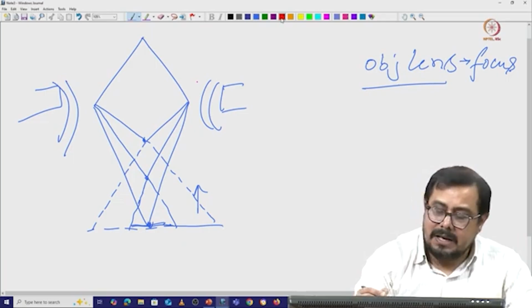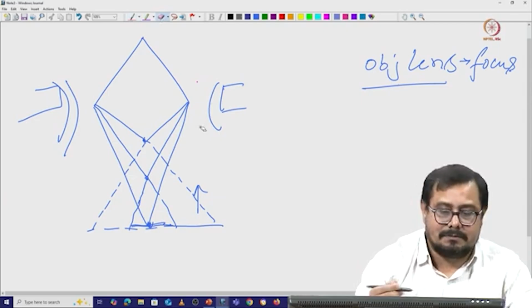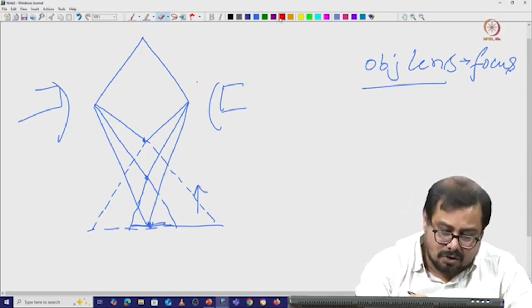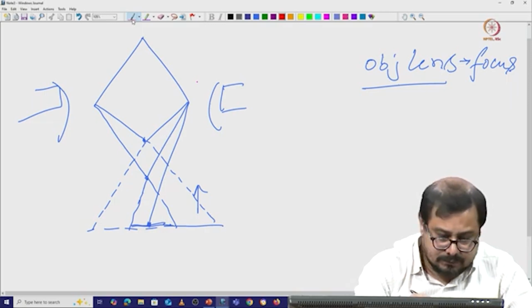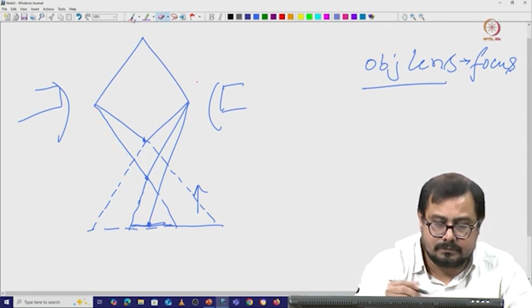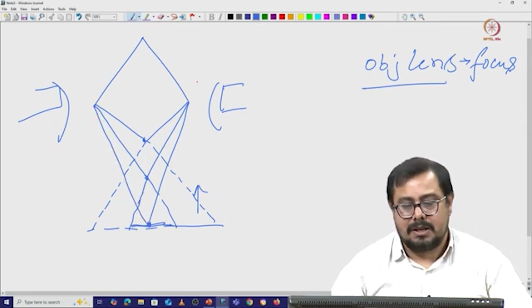One more possibility, if we are using a very weak magnetic field. So let us erase this one, a very weak magnetic field. So there is not too much pressure. This is one of our electron beams. It is coming and merging somewhere here, right?